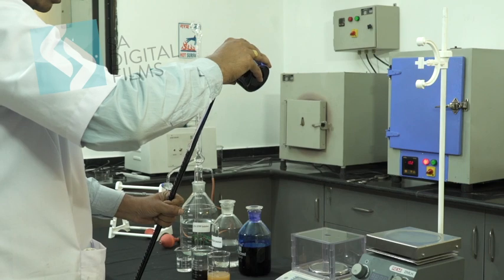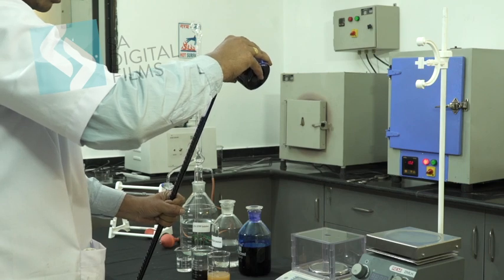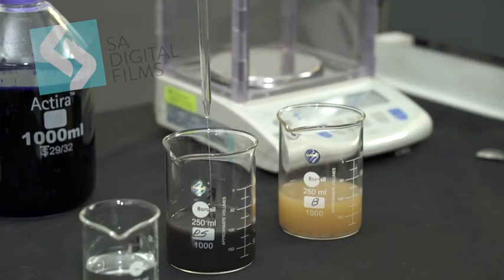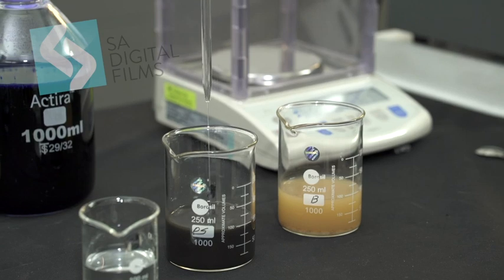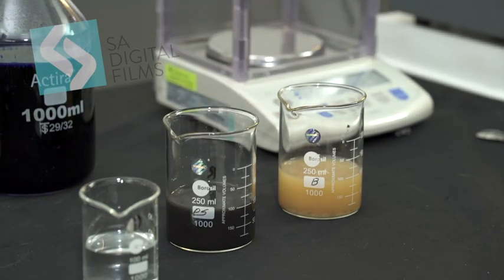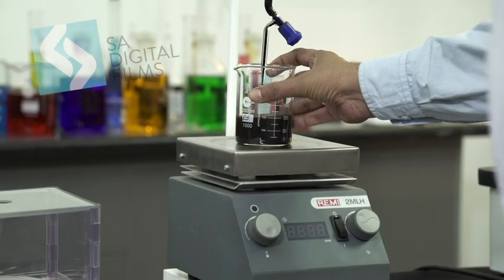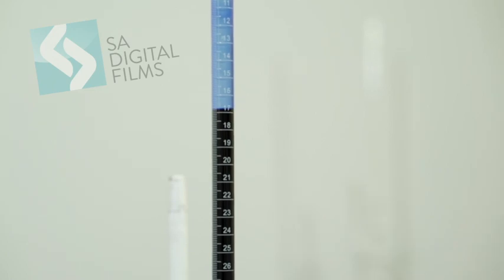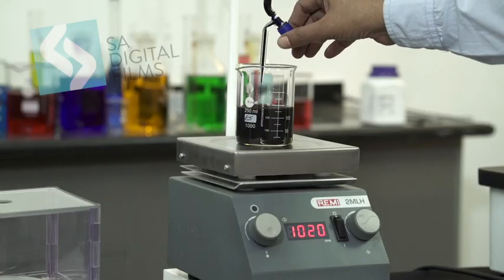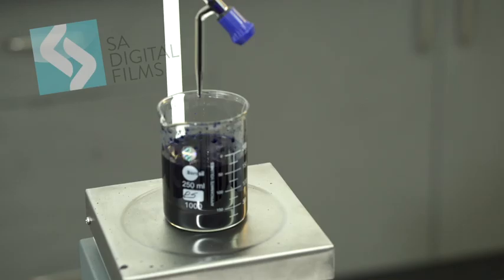Fill the burette with 0.01 N methylene blue solution and adjust the zero mark. Step 5. Add 2 ml of 5 normal H2SO4 solution and put the magnetic bar in the solution. Keep the beaker on the magnetic stirrer and switch it on. Step 6. Add 80 to 90% of the estimated methylene blue solution 0.01 N. The suspension is then stirred for 2 minutes.